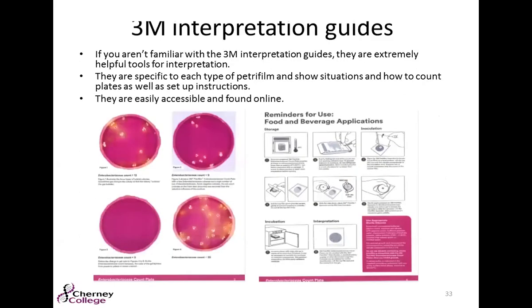If you aren't familiar, 3M does provide interpretation guides, and they are extremely useful, especially to people who are new to interpreting plates. This is kind of a lifeline. It's very easy to use. They're very user-friendly, and they're specific to each type of Petrifilm and show situations and how to count plates, as well as some simple setup instructions to follow. They're easily accessible. You can find them online. And like I said, I've found them to be a very great resource, especially for training new technicians.